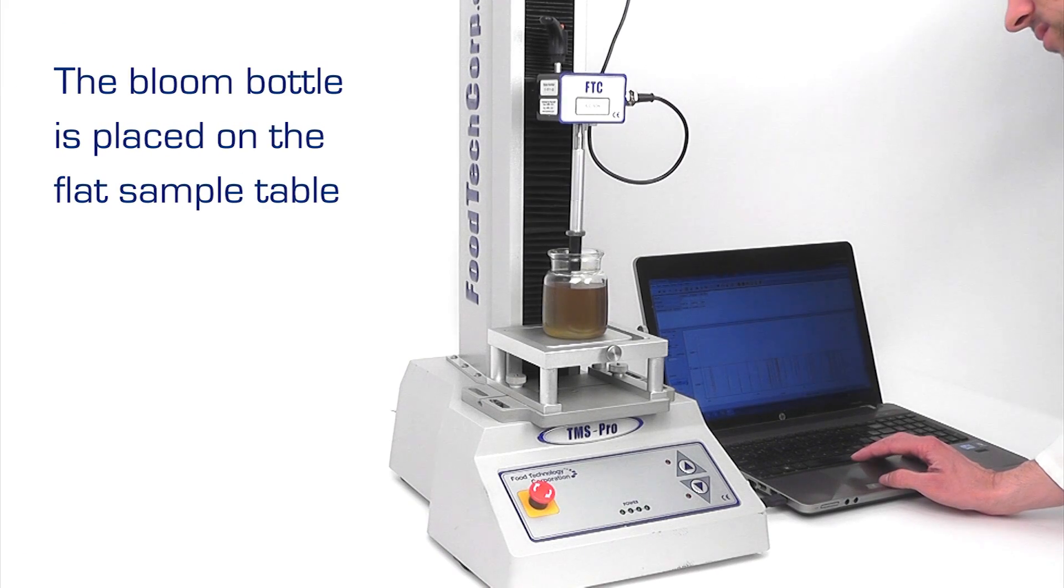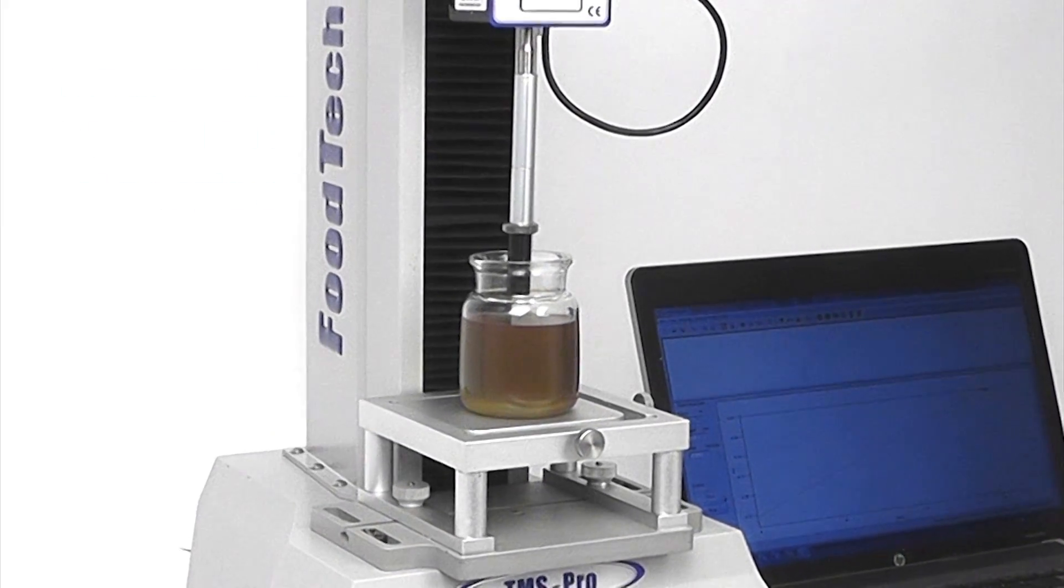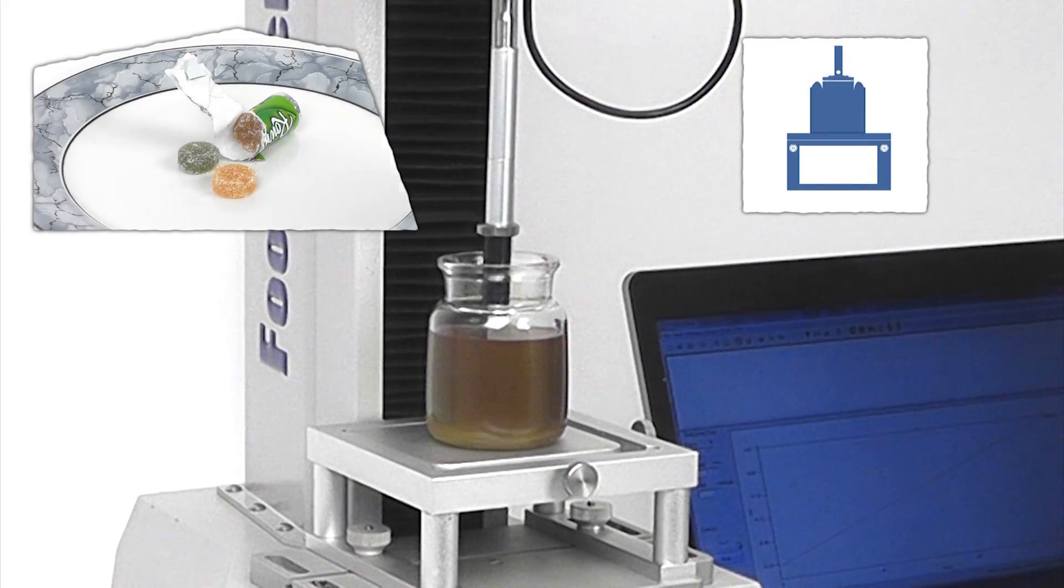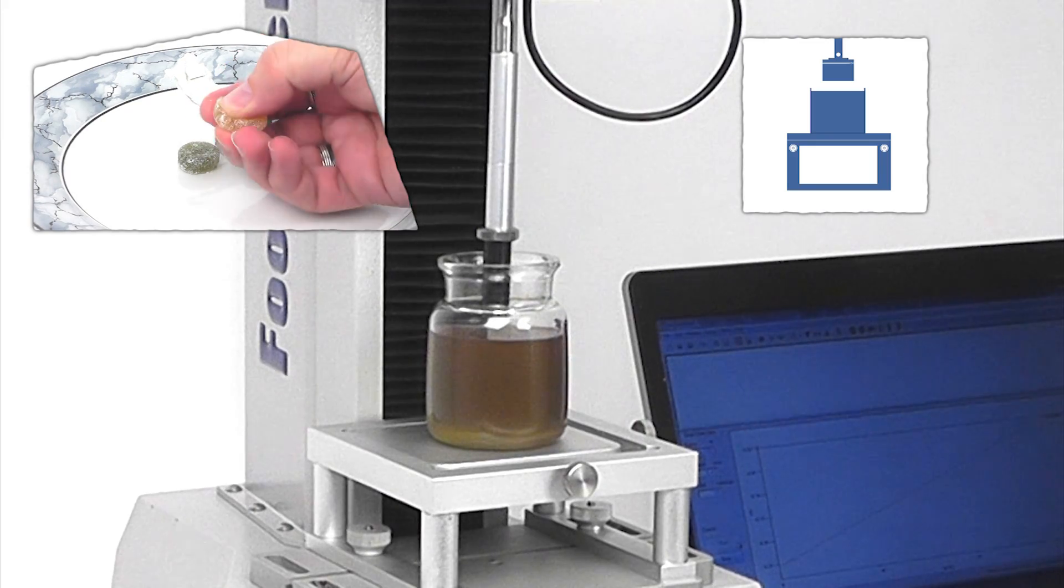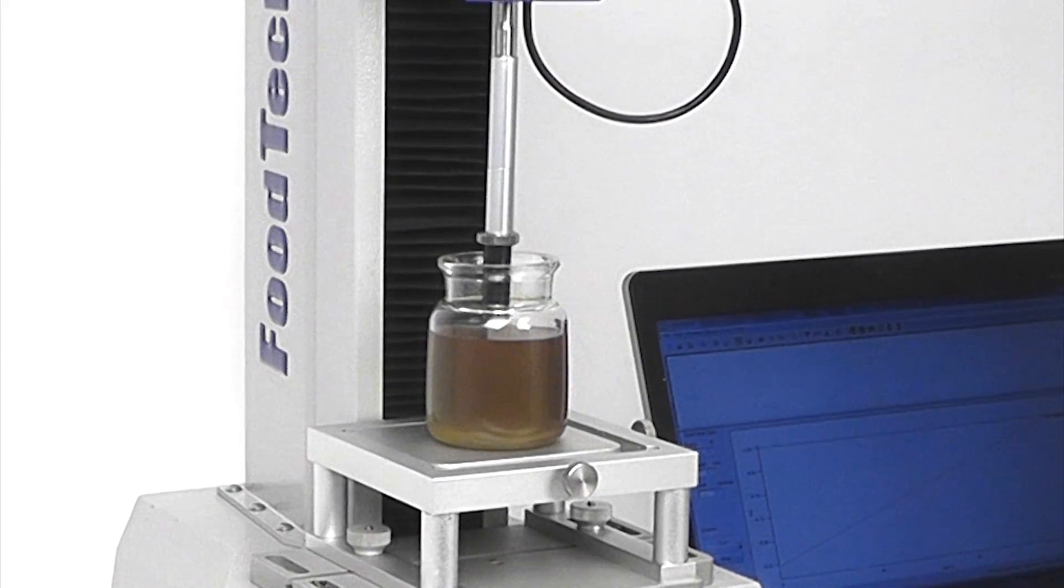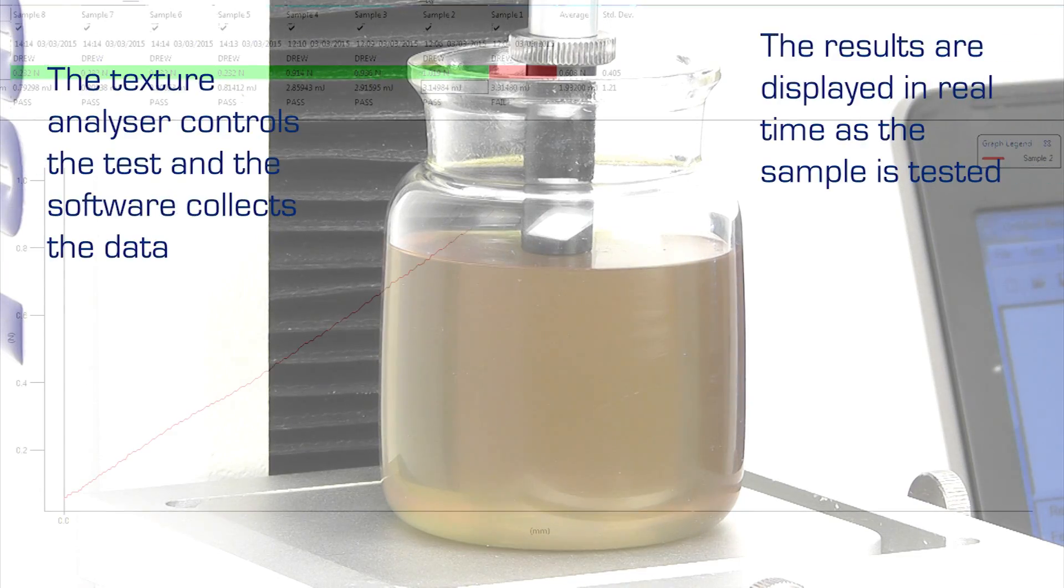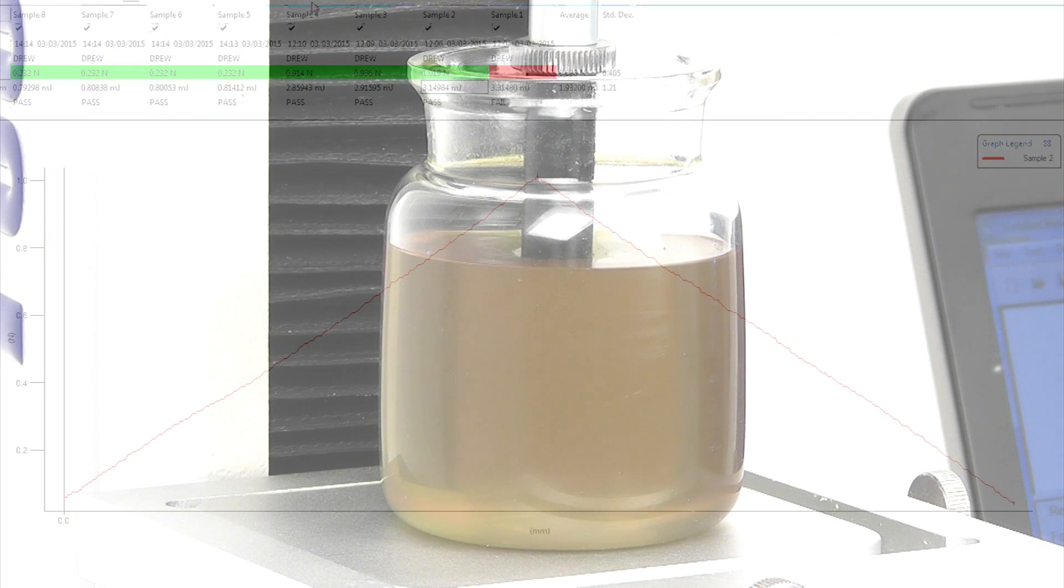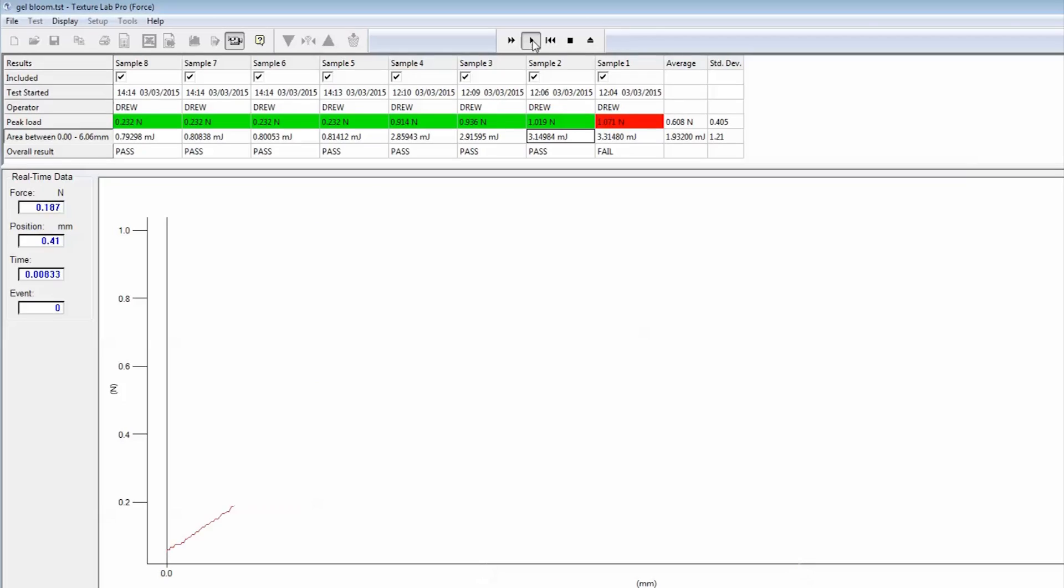The prepared gel sample is placed on the flat surface, aligned with the probe. The texture analyzer controls the whole procedure automatically. The flat surface of the cylinder locally compresses the surface of the gel by 4 mm. Real-time graphing clearly shows the behavior of the sample under test.